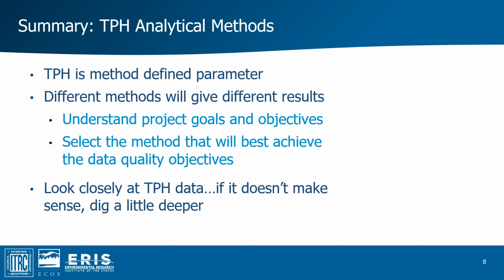TPH data is complicated because of the number of chemicals included in the results. So look closely at your data. Don't take things that don't make sense at face value. When in doubt, dig a little deeper.